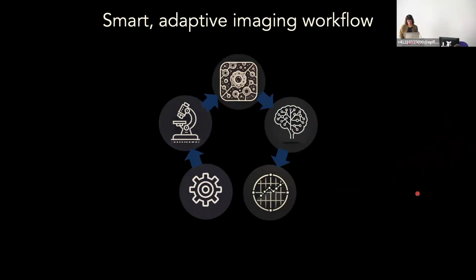One of the things that I thought in the beginning is that, given that people are developing all of these artificial neural networks for segmentation and other tasks, perhaps what we could do is simply repurpose those same neural networks to drive our microscopes. It's not quite that simple. Closing this loop is not quite that simple. Event detection in dynamic systems is both a different challenge and offers different opportunities for detecting more subtle events, in my view.